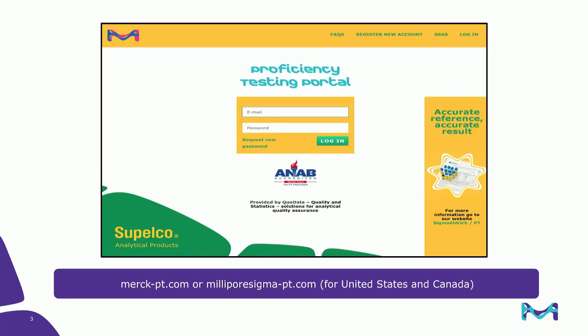We have taken your feedback shared with us over the years and used this to help improve our service to you. With this new portal, you will find new features including your methods now saved as default, graphical reports, the option to trend your data, as well as the ability to expand and collapse your items on the data entry screen, which will allow for quicker loading times.